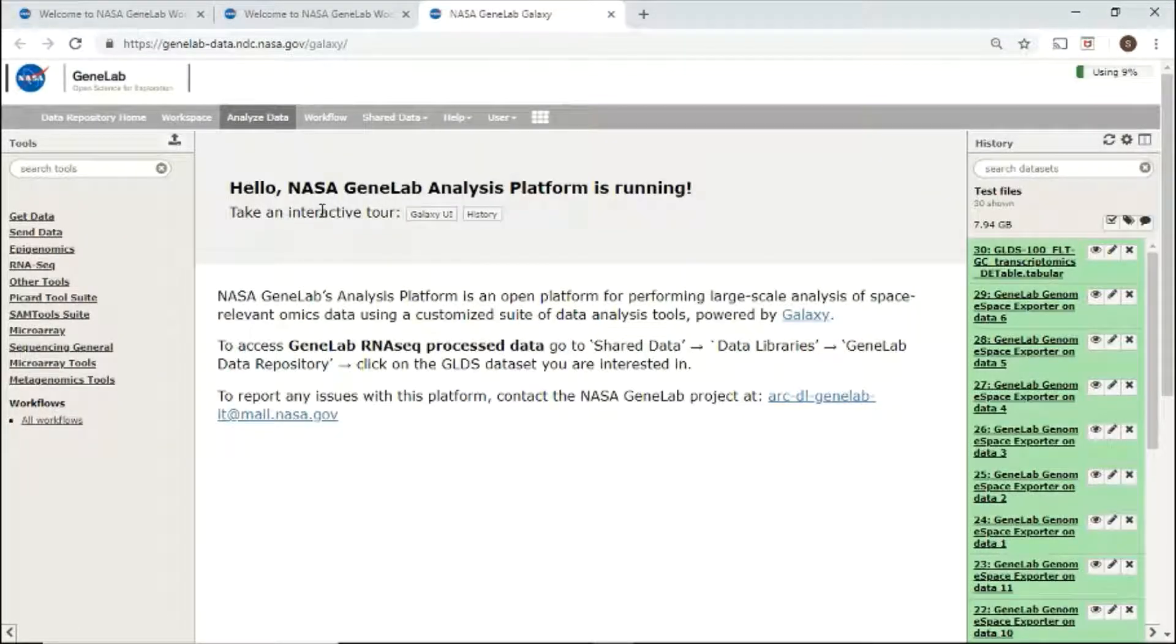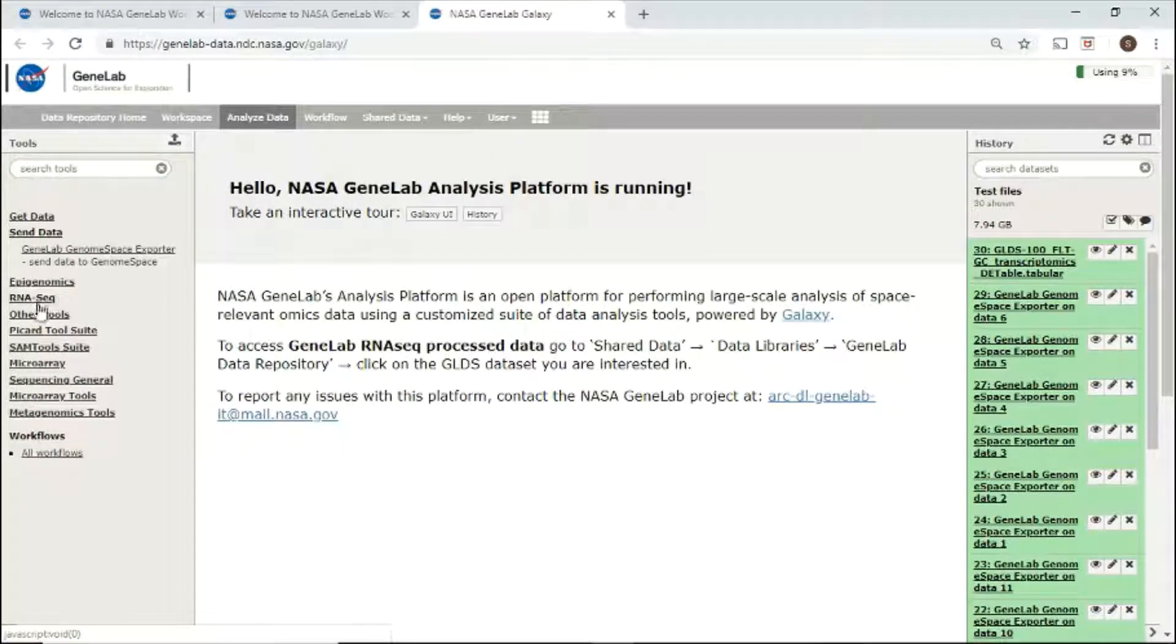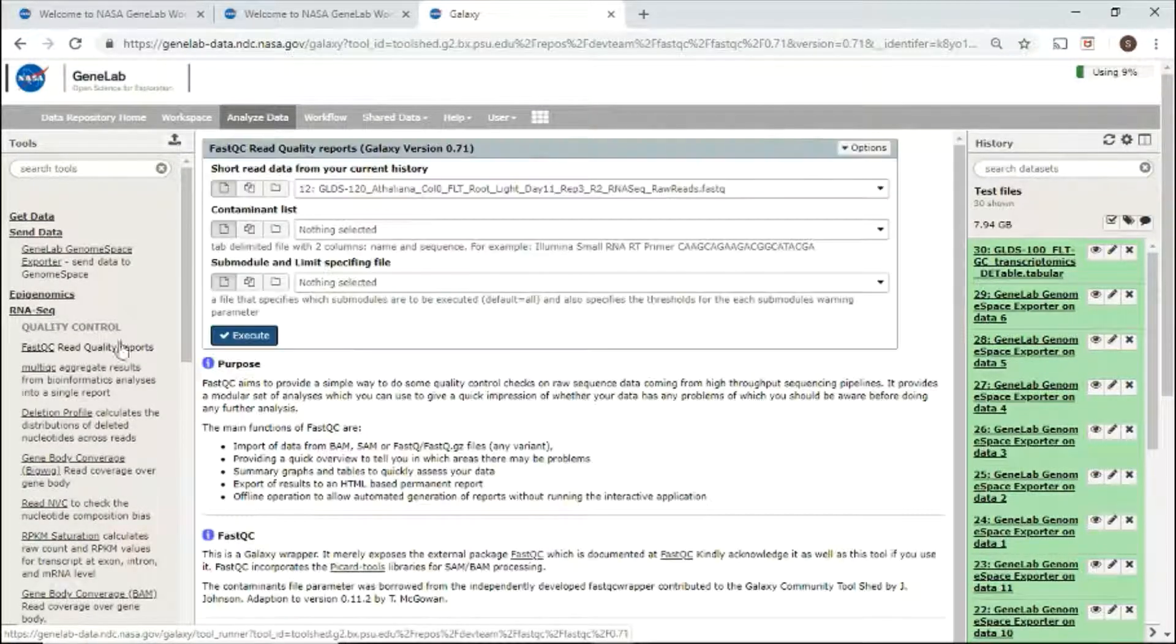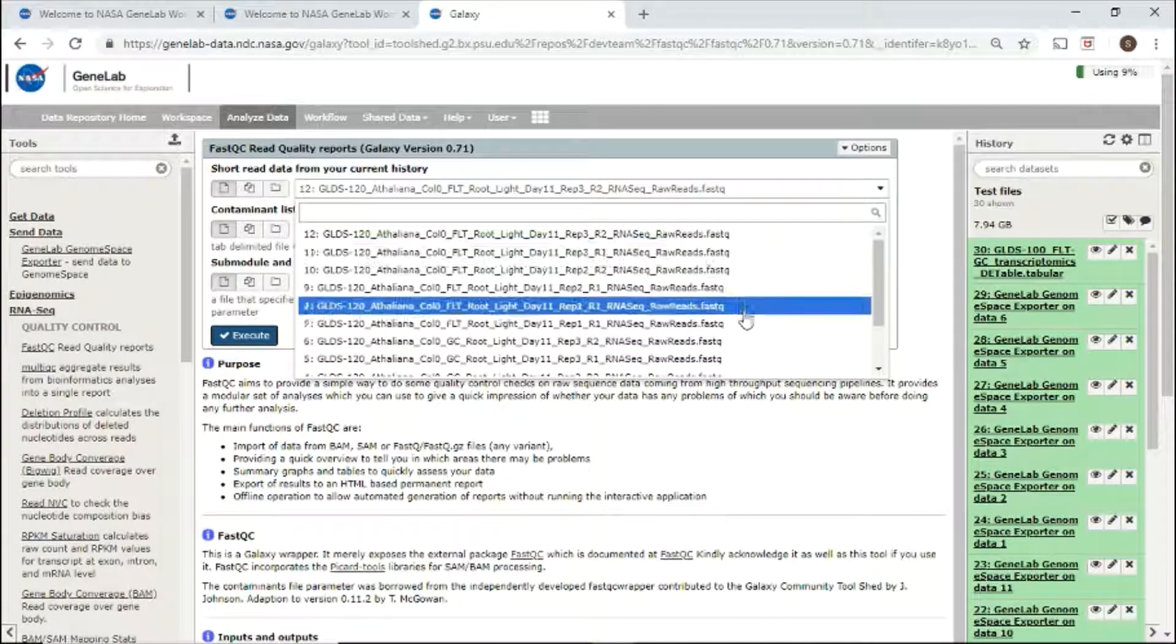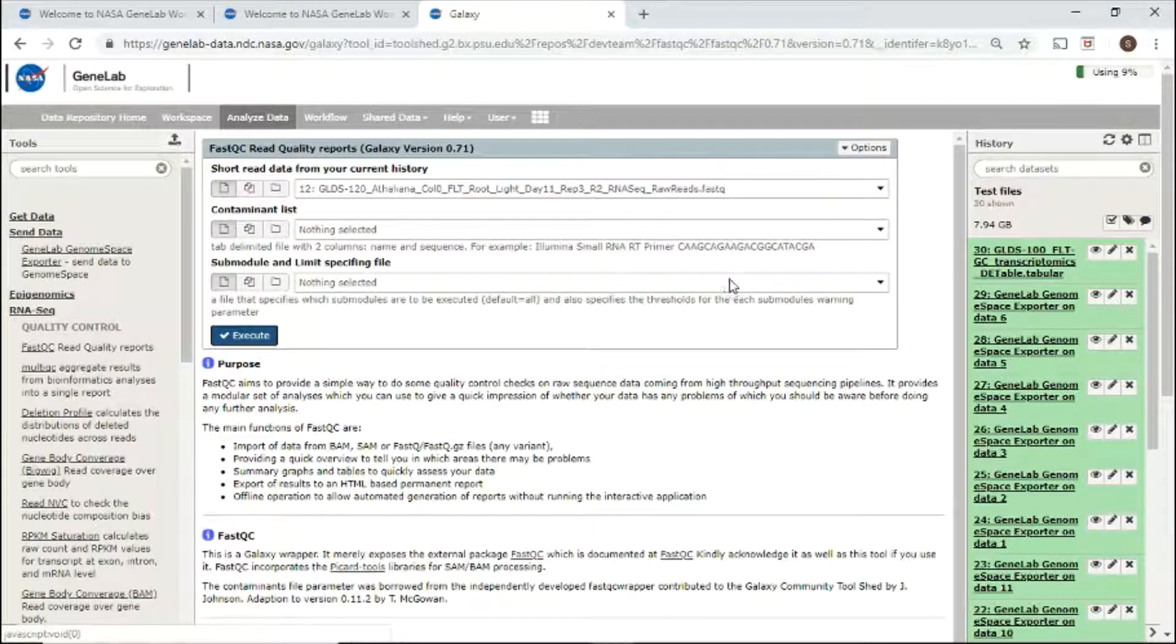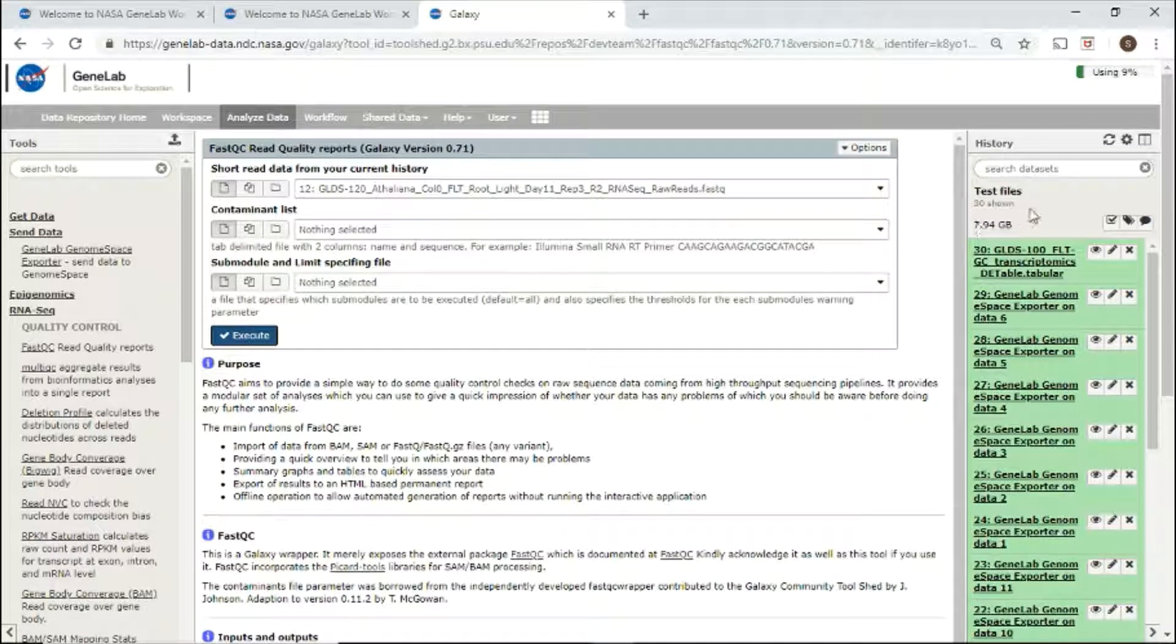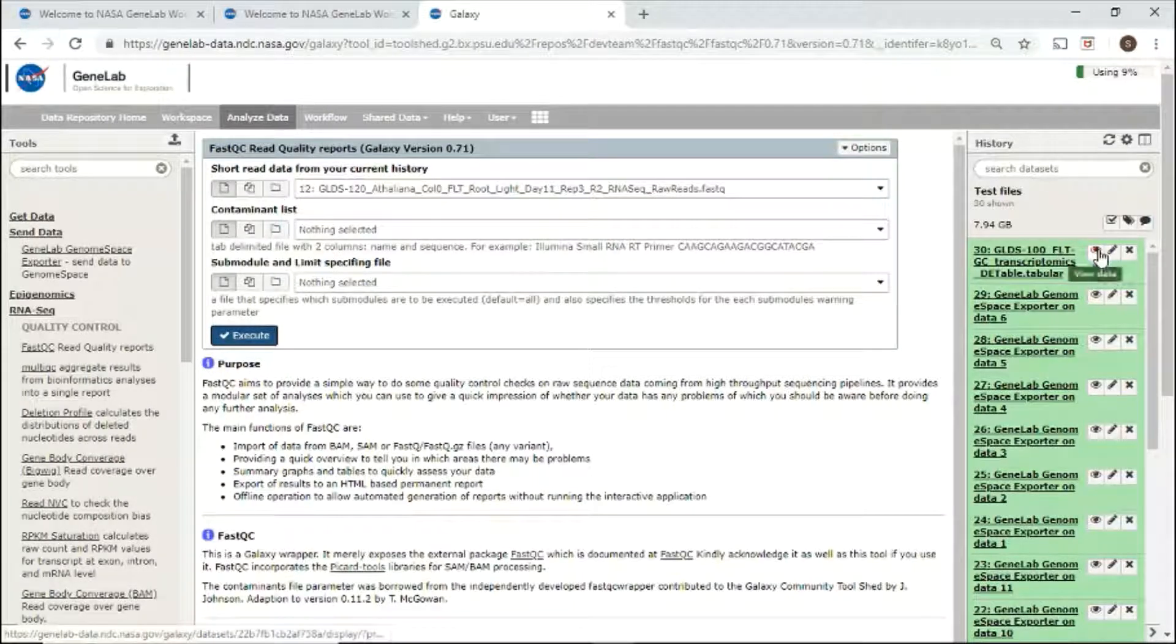In the analysis platform, users can analyze omics data. On the left-hand side, you can search and select tools from the tool share. For example, if I select tool FastQC, I can select files from my history, select parameters, and click execute to start the job. Use the history panel on the right-hand side to see job status and results.